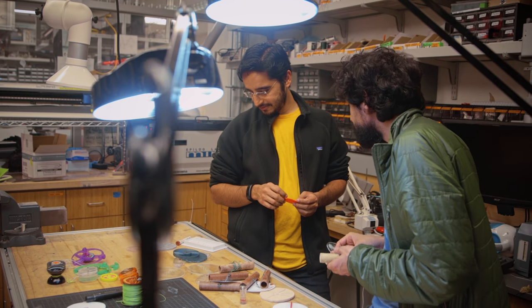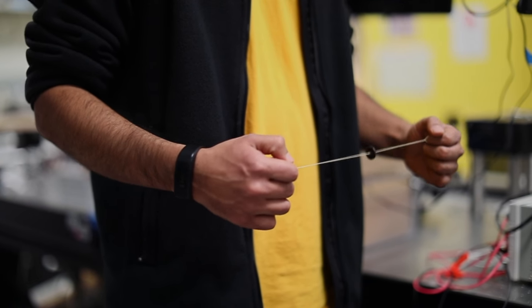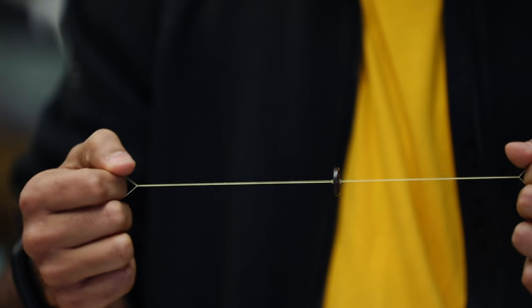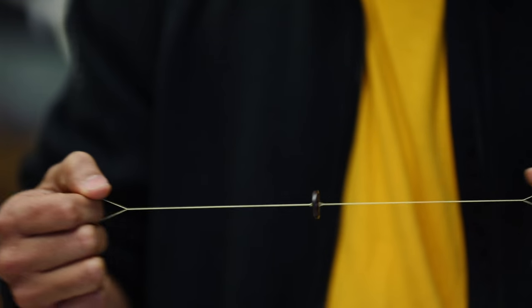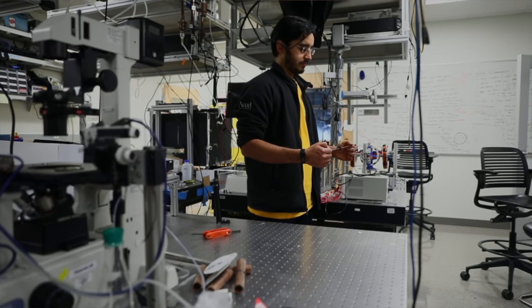It is an ultra-low-cost centrifuge built out of principles of a very old toy, the Whirligig — a toy I used to play with as a kid. The puzzle was that I didn't know how fast this would spin. So I got intrigued, set it up on a high-speed camera, and I couldn't believe my eyes. When you heard the noise, it was actually going at 10,000 to 15,000 RPM.